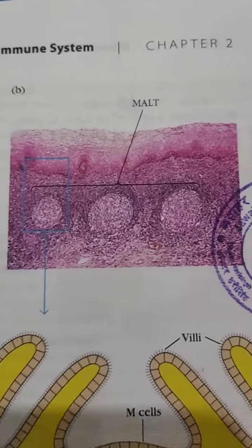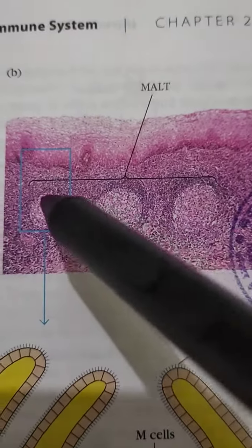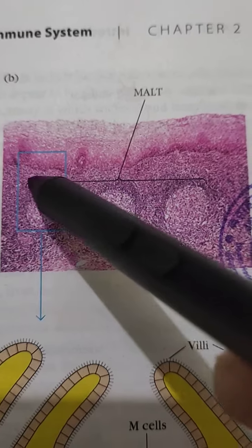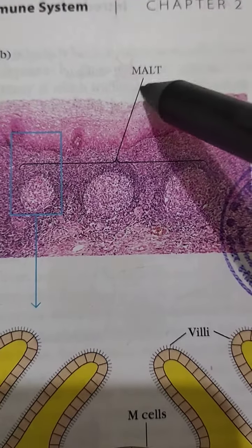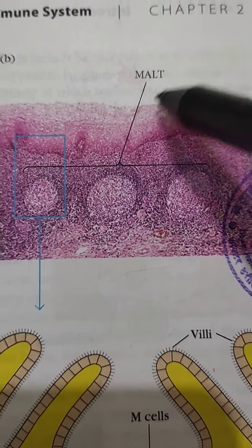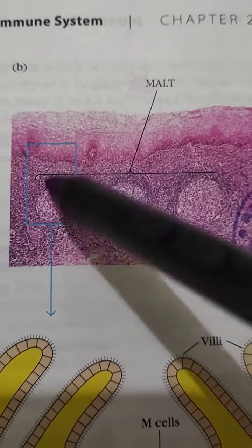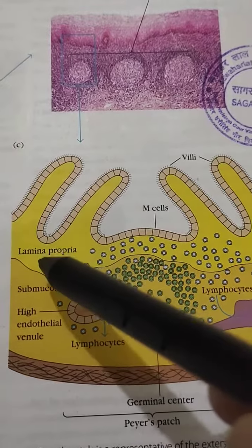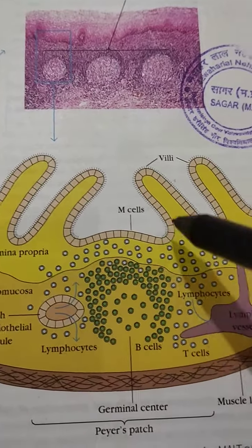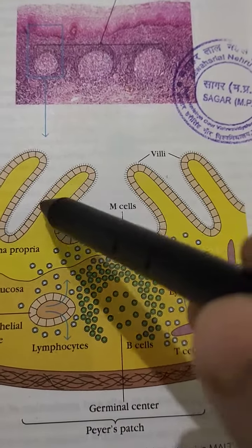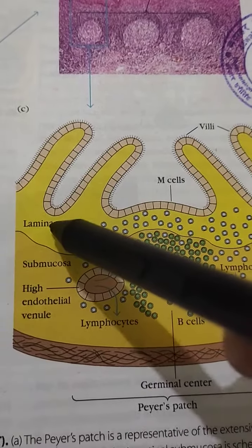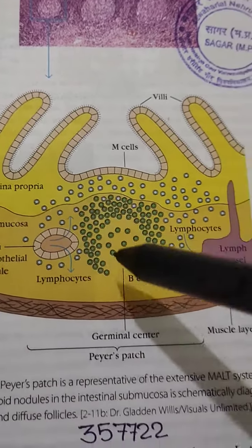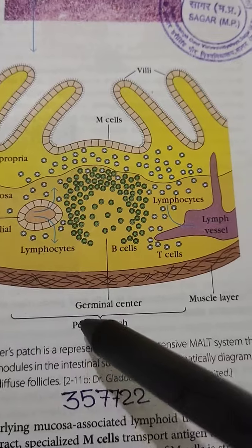This is the stained section of MALT tissue, and these are lymphoid follicles. If we see this MALT — mucosa-associated lymphoid tissue — cross-section in detail, we find that this is the lamina propria in the intestine. These are villi, M cells that recognize antigen, and in the lamina propria this is Peyer's patches.